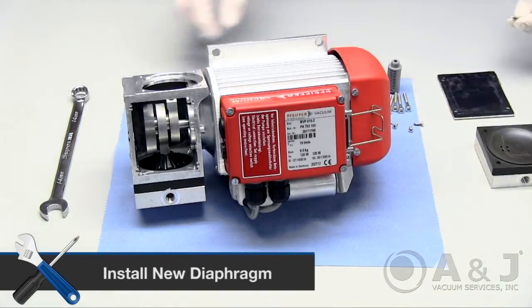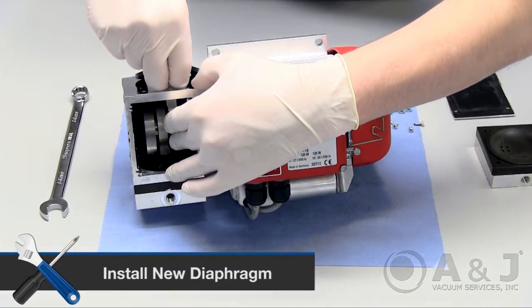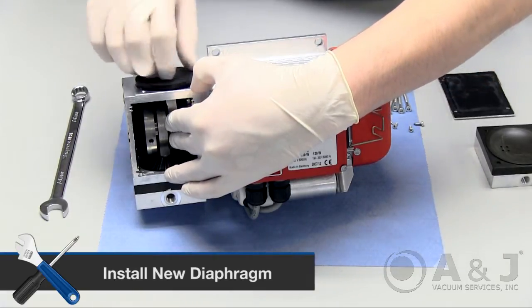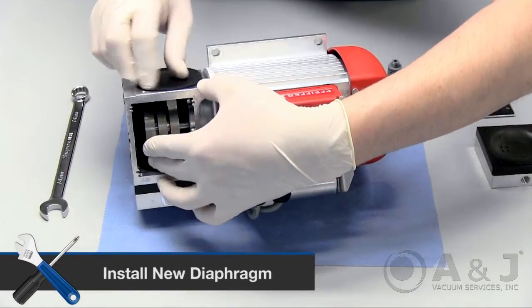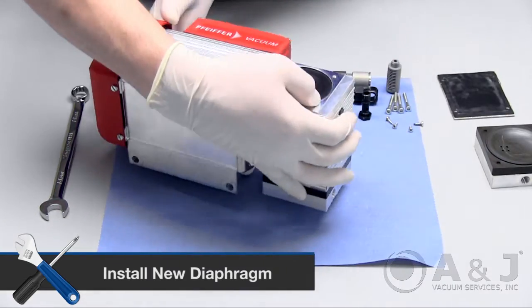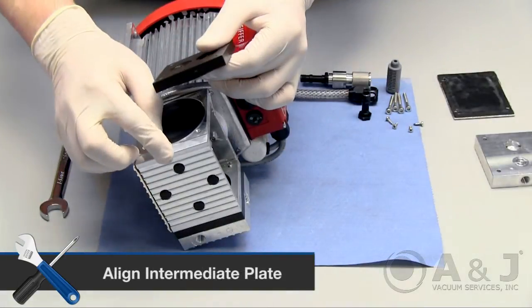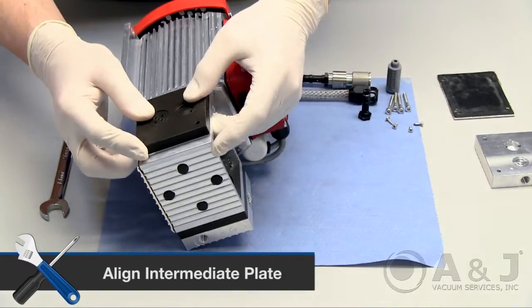Take the new diaphragm and place the old shim at the bottom of the threading. Screw the diaphragm back in holding the shaft with your other hand to prevent the shim from slipping. Press down on the perimeter of the diaphragm to secure and place on top of the shaft housing. Take the intermediate plate and align the number to the number on the shaft housing to ensure proper alignment and orientation.